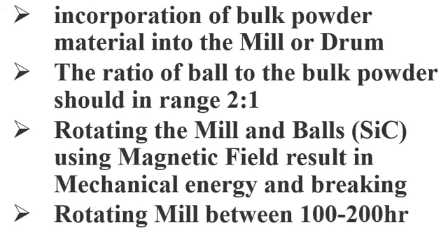Please note, dear student, as I previously discussed, the ball milling process usually takes 24 hours. But if you want to prepare very fine nanoparticles, the time of ball milling rotation may take up to hundreds and even 200 hours. So this is a time consuming process.